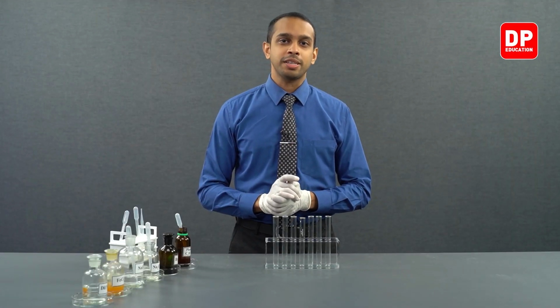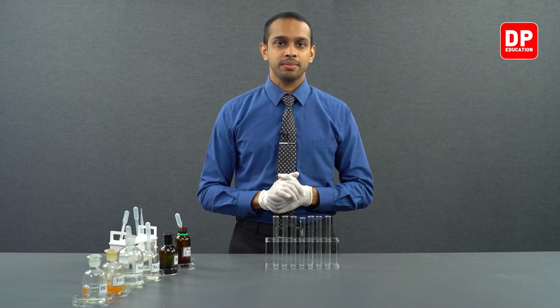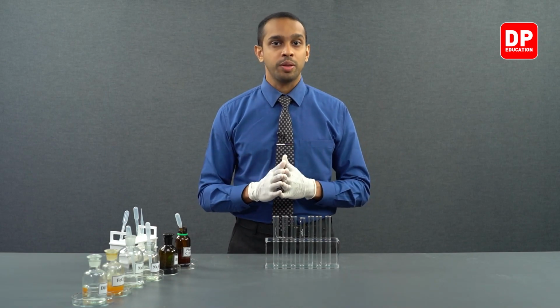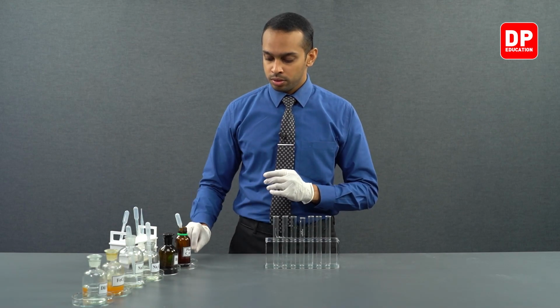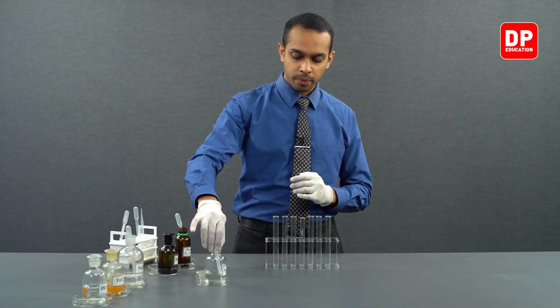In this part of our practical, we are going to see how phenol reacts with sodium carbonate. We need to observe if phenol is acidic enough to have a reaction with sodium carbonate. Now, we will be taking sodium carbonate solution for this.